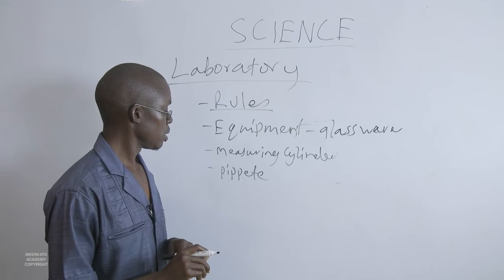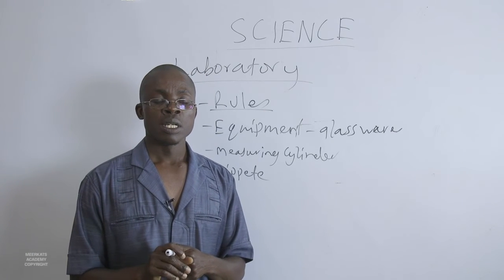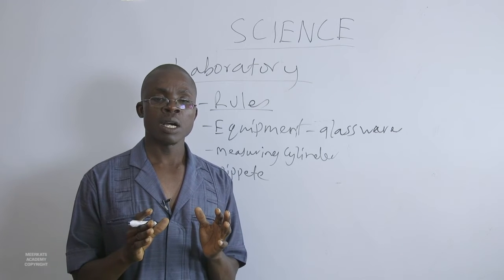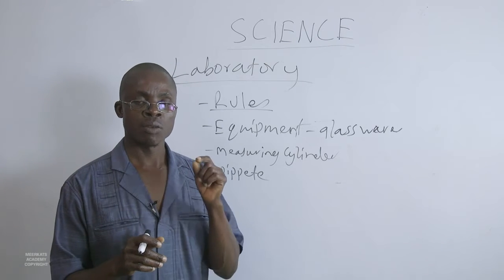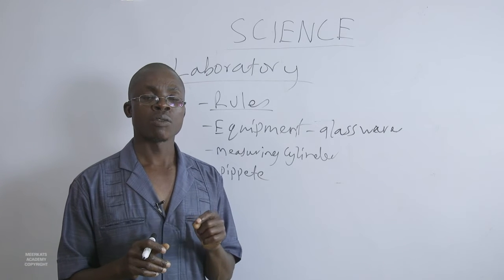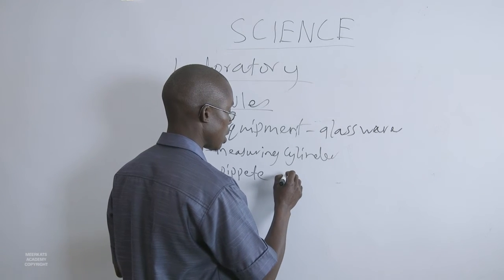It's a pipette. A pipette is a glassware to measure volume, but exact volumes of that particular solution. And this is how it looks like.